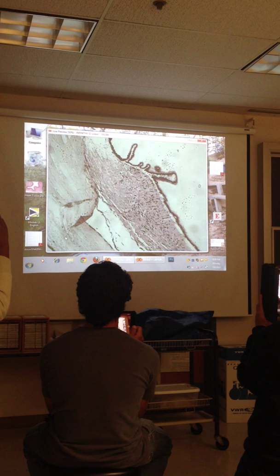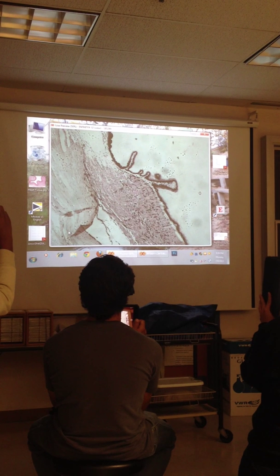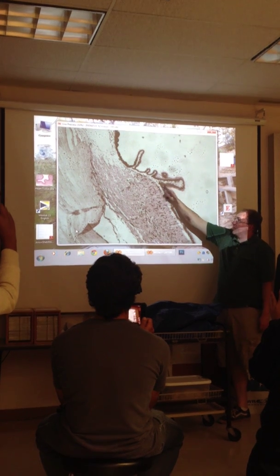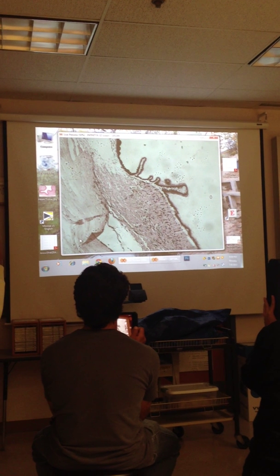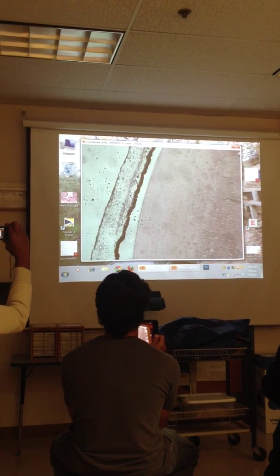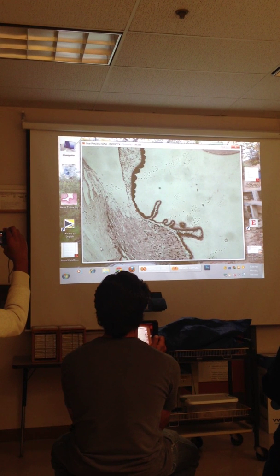So right here, you start to see the vascular tunic. That's a little bit of ciliary body that you see poking out back here. Sometimes you see bigger patches of ciliary body, but you see how dark it is and how it makes all those folds. You might see more as we work our way around here. But I'm going to pop back up for a second so you can follow that, so you can follow up from the ciliary body there.